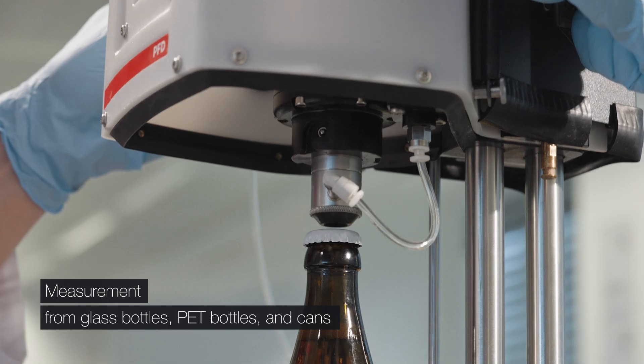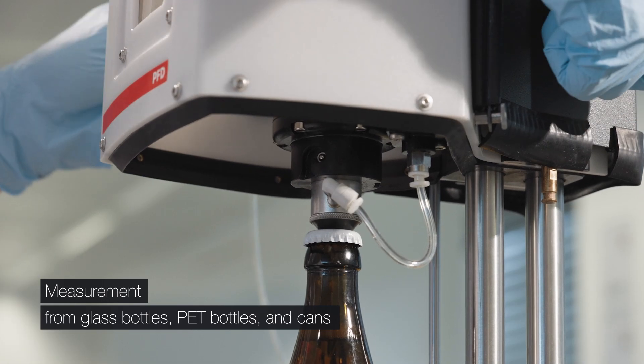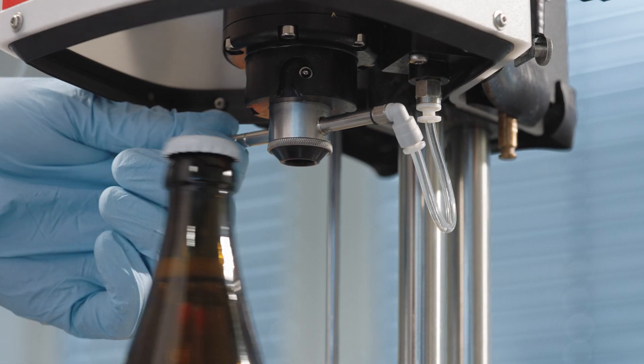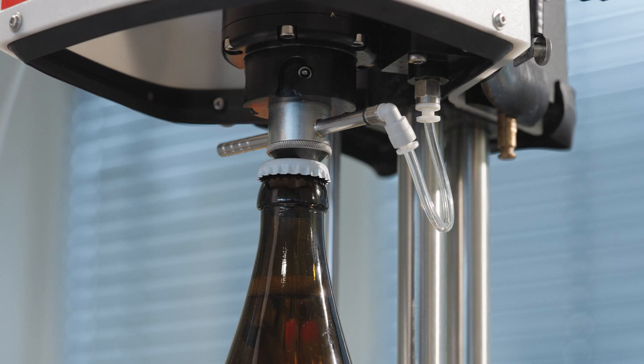Place the glass bottle in the center of the PFD, lower the piercing head until the marking disappears, and lock it. For a new measurement, just lift the handle a little and place the bottle inside.